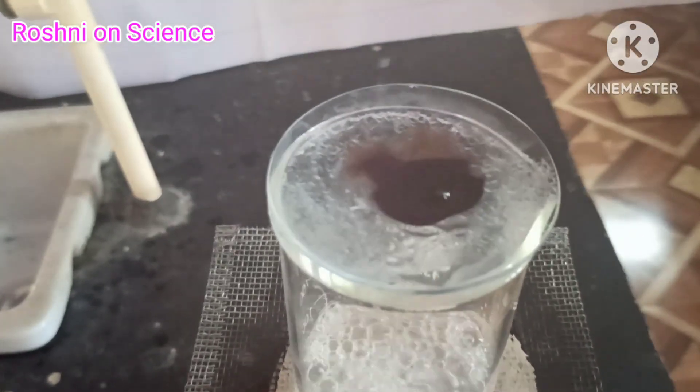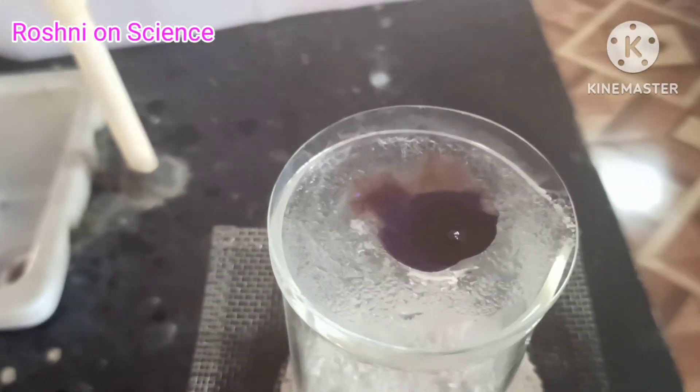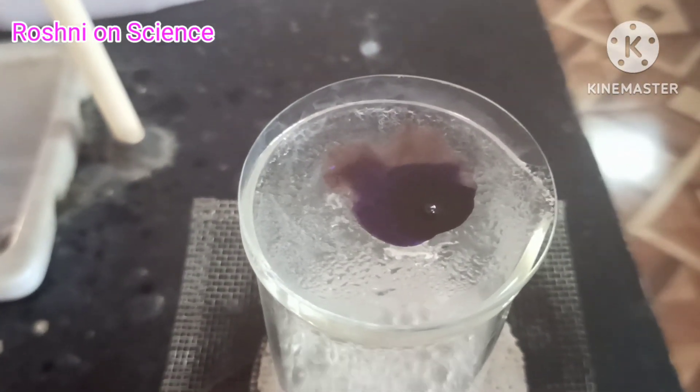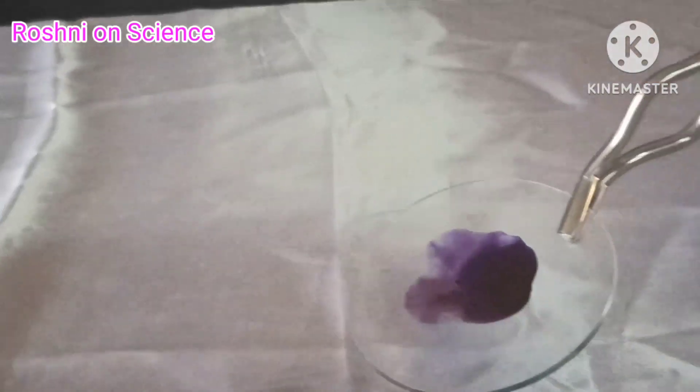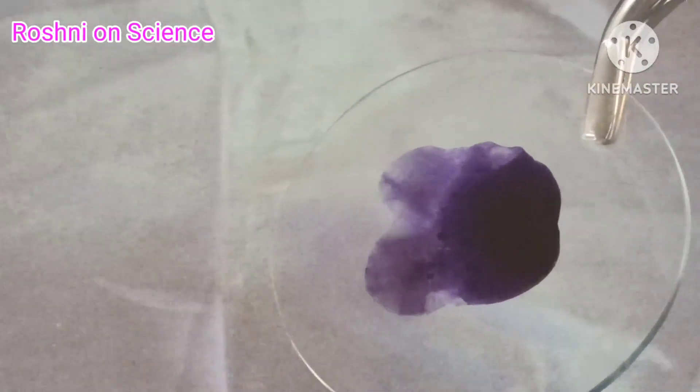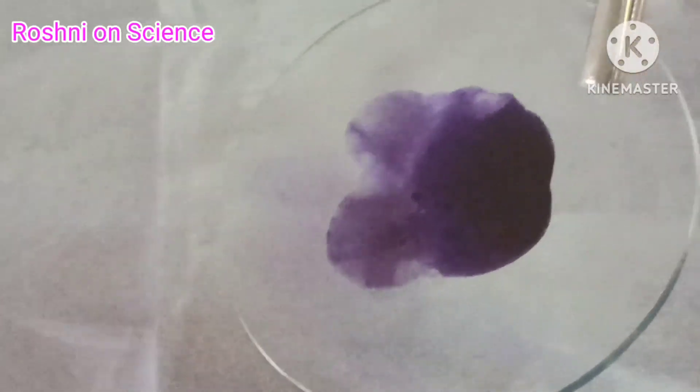We find that ink is a mixture of a dye in water. Thus, we can separate the volatile component, i.e., solvent water, from its non-volatile solute by the method of evaporation.